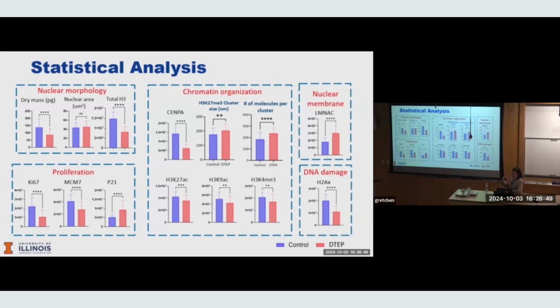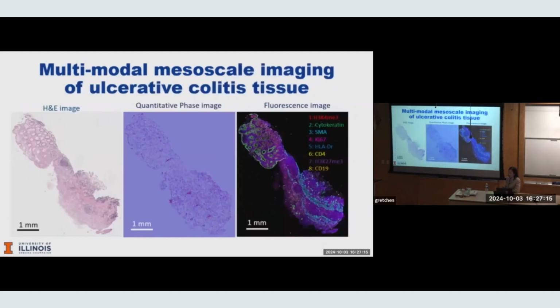All this could partially be pointing out that eventually they're trying to lower the level of DNA damage to reduce their susceptibility to the lethal drug. So that gives you an example of how we can combine this multi-scale information to gain insight into how the cancer cell develops resistance.